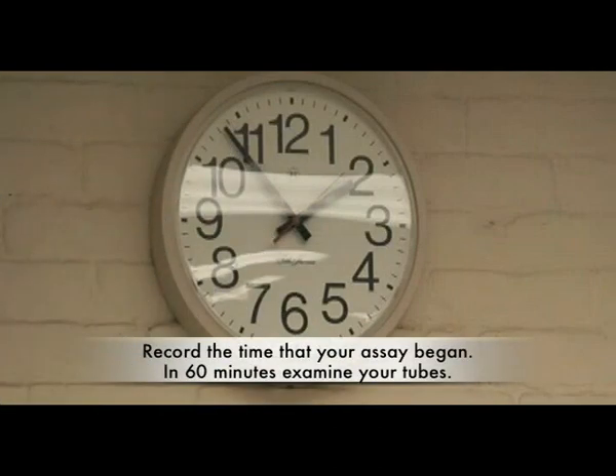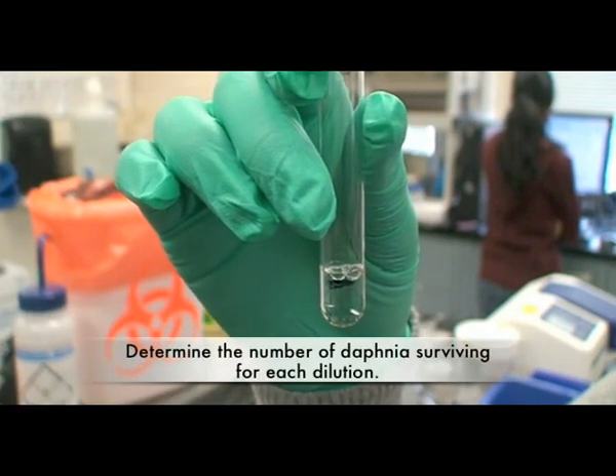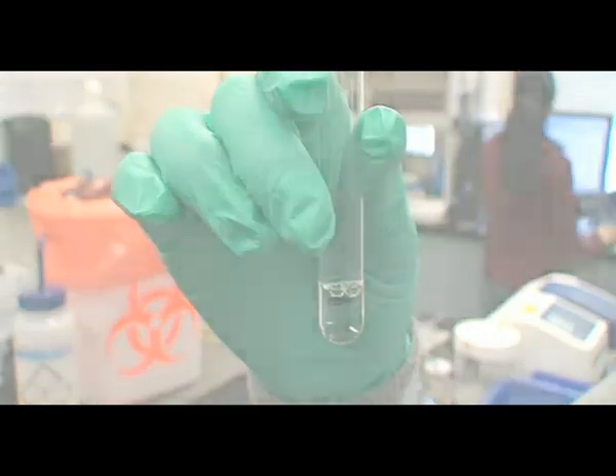Record the time that your assay began. In 60 minutes, examine your tubes and determine the number of Daphnia surviving for each dilution.